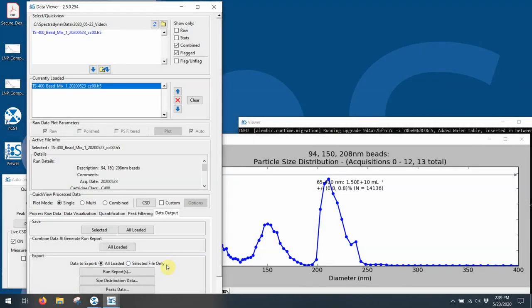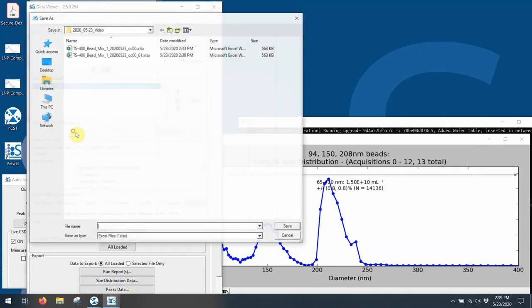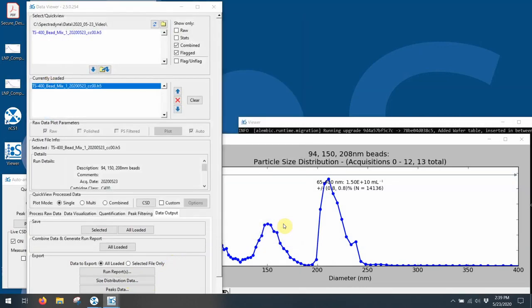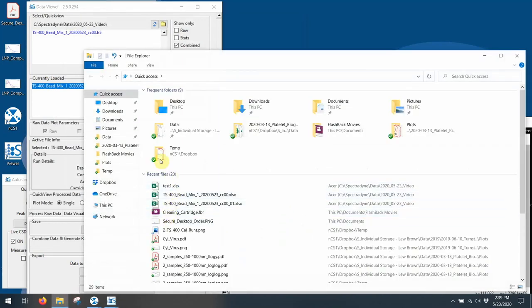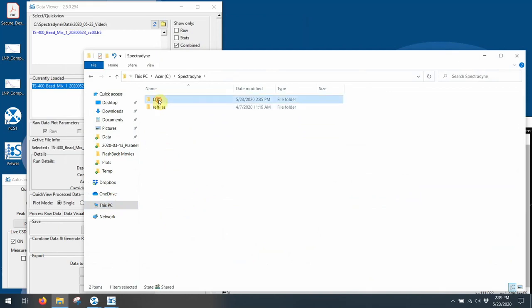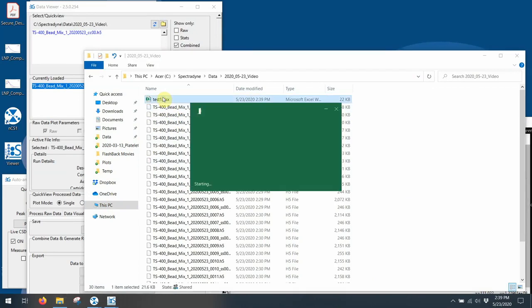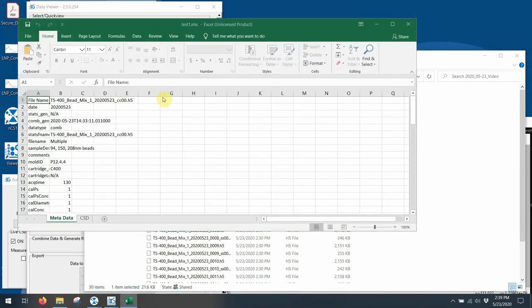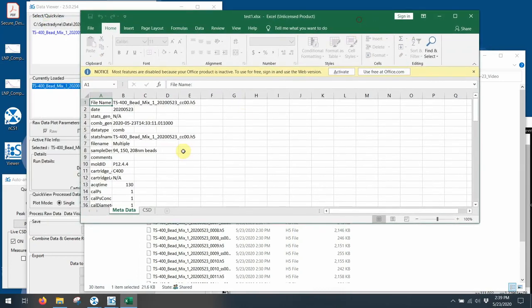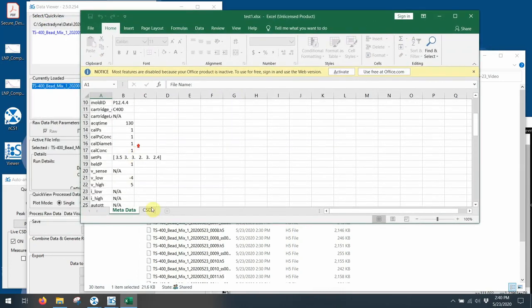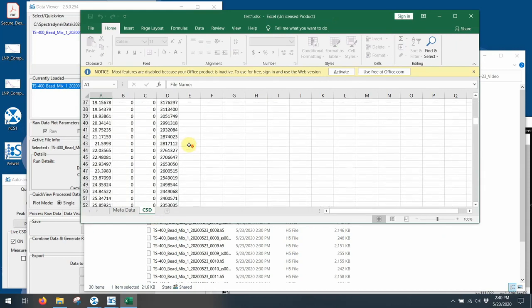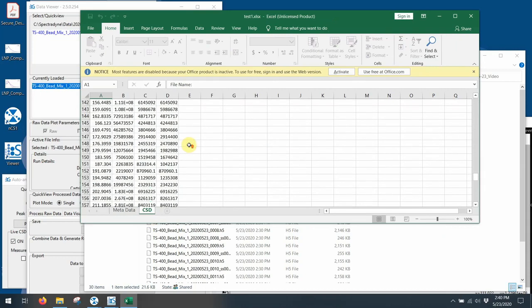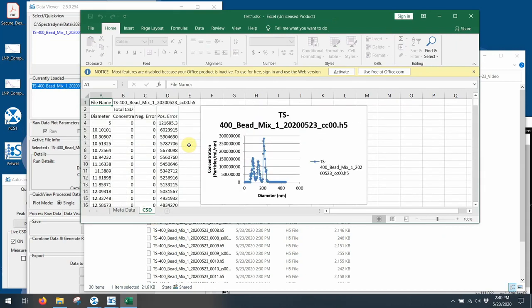I can also generate a size distribution data report. Which I'll just call, in this case, I'll just call it test one. I say save. And I'll quickly show you what exactly that's done by again, navigating to my data folder. And finding that test file. And you can see here, the first tab is all my metadata. And the second tab is the actual concentration data, binned by however I've asked it to be binned. And the actual plots itself. So this is now output as an Excel file, which I can do whatever I want with.